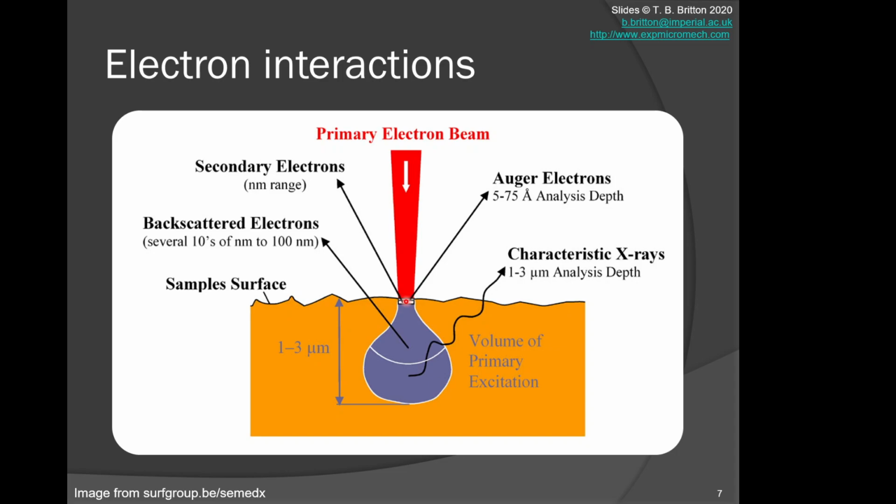of our electron beam. Now, the primary electron beam will not just go and create these secondary electrons, it will continue rattling into the system. So it will effectively go into the material and scatter through primary electron beam-matter interactions. Eventually, some of these primary electrons can be bounced back out of the sample, and they produce what we call the characteristic backscatter electrons. And these vary from the spatial source of the initial beam to tens to hundreds of nanometers away. And so the resolution of backscatter is typically less good than the resolution of the secondary electron image.